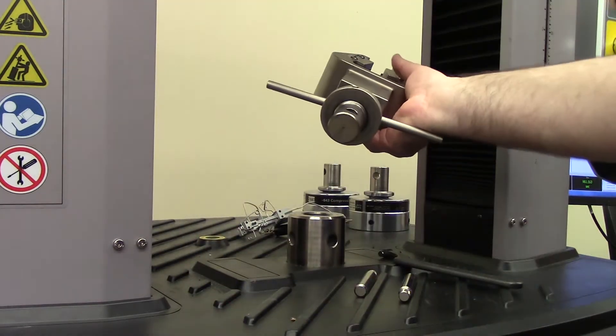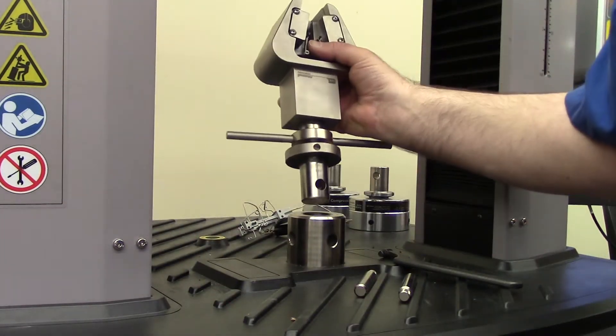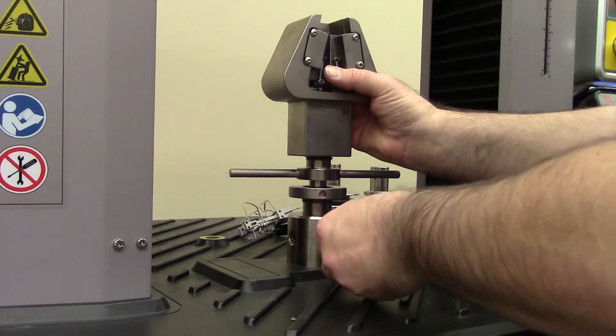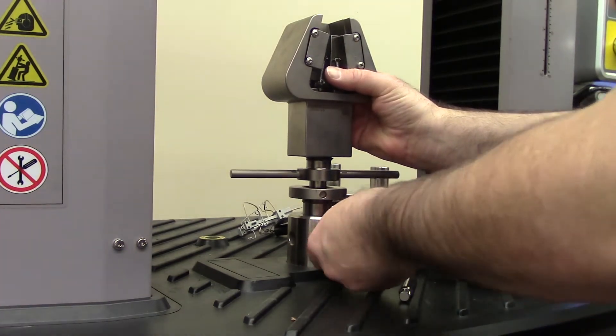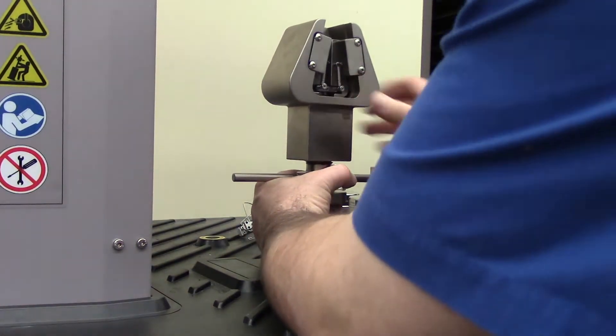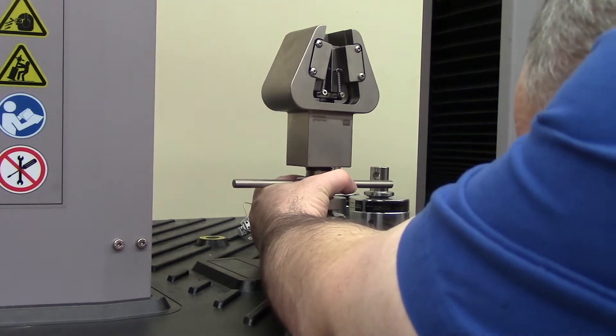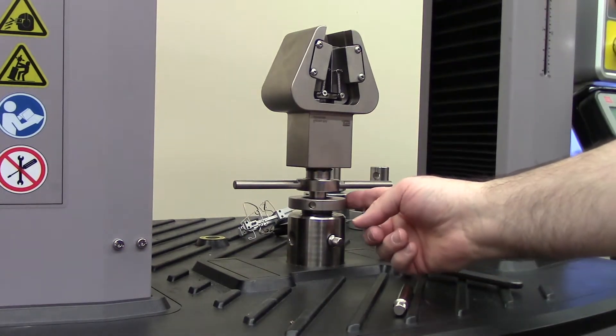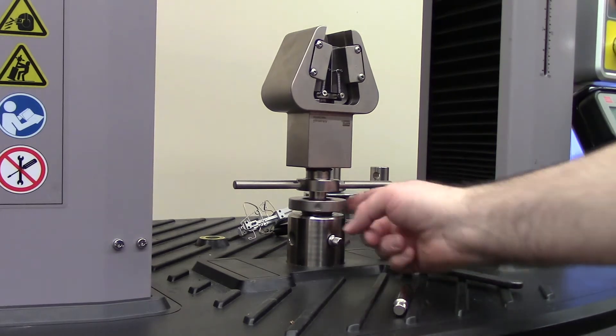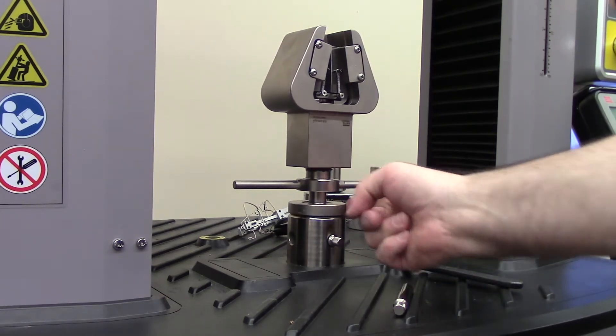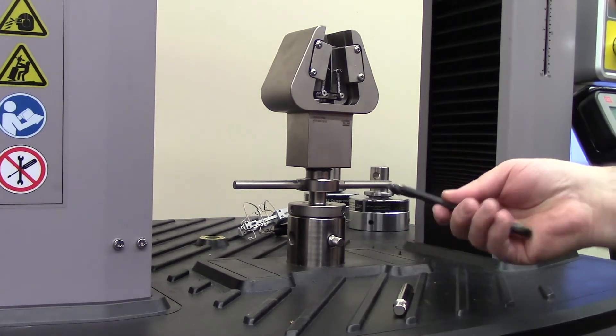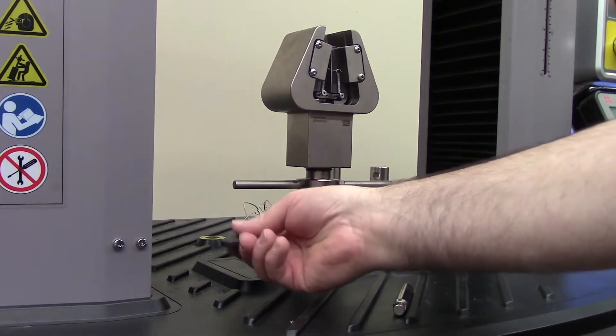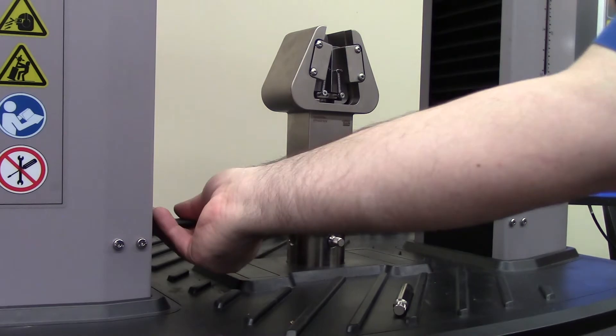Similar to the compression platen, this goes in and the pin goes through it. Then this has to get tightened up. It should be flush, and if it gets stuck or you want to put a little bit more on it, you can use the spanner and tighten that up.